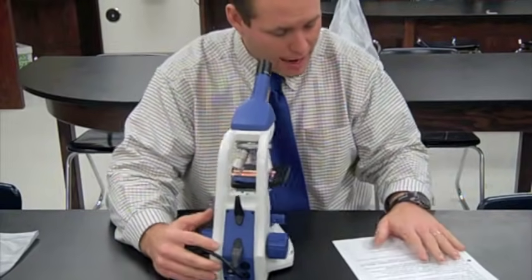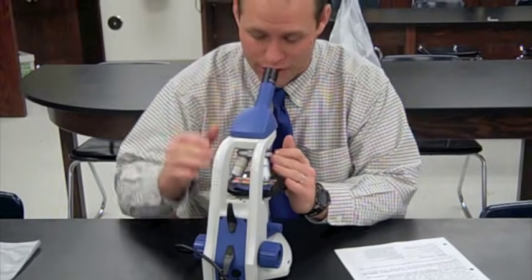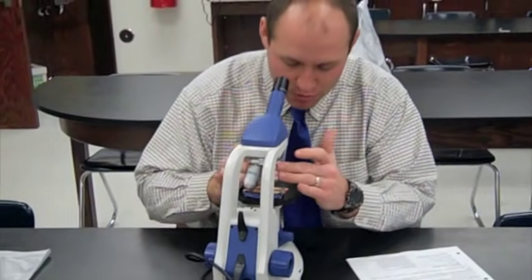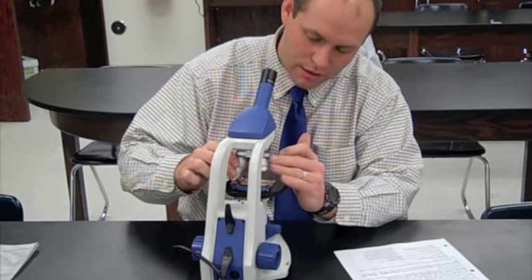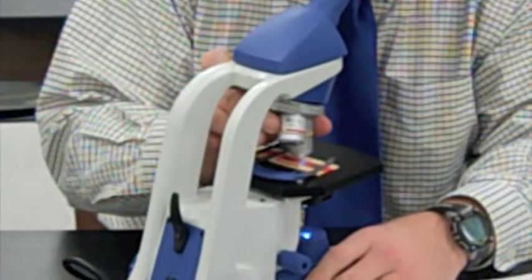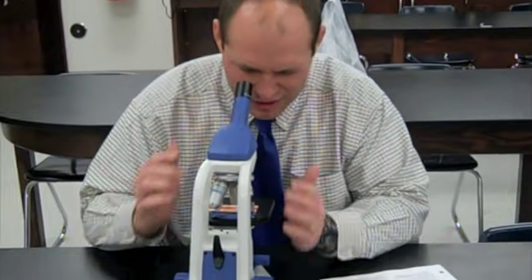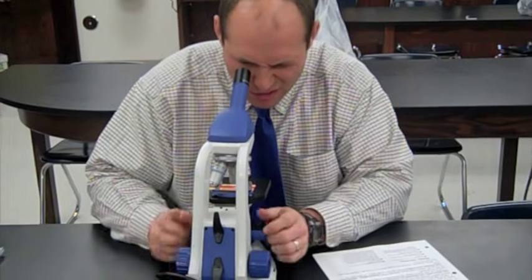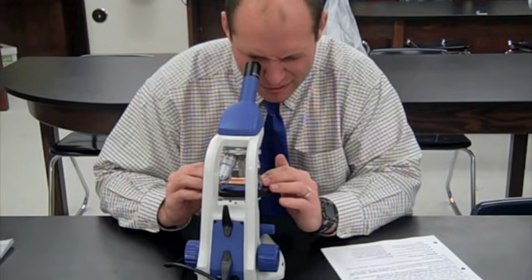Okay. Now, we're going to switch from 4x to 10x. That's going to turn our total magnification up to 100x. You do not need to move the slide or the stage. All you need is to click in the objective lens as you see right here. And remember, it should click into place. You should hear it. Okay, now we're back, and I'm focusing using the 10x power of the objective lens. I'm going to focus using the coarse and the fine adjustment to make sure that's as focused as I need it to be when I switch to the next power.